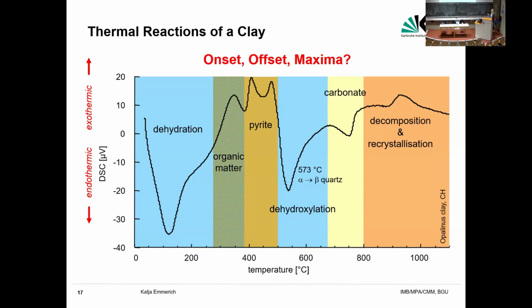So this Opalinus clay was heated in streaming air, synthetic air. You see at low temperatures dehydration takes place. You see a very intense endothermal reaction. But then this dehydration is followed by the oxidation of organic matter and the oxidation of pyrite, iron sulfide.